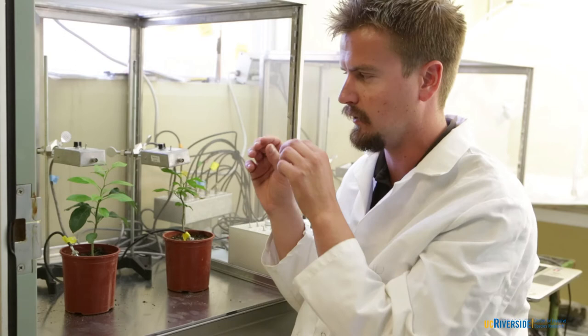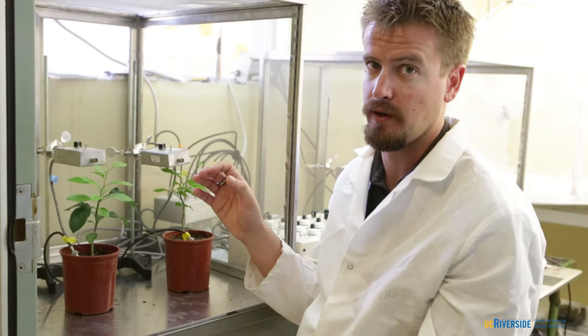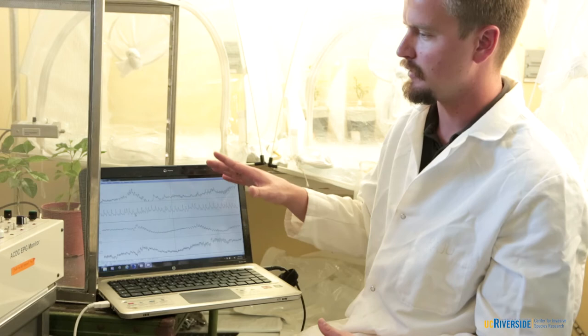That's exactly what I'm doing here, except that I'm using the little teeny tiny muscles and valves inside the insect's head while it's pumping and sucking away different parts of the plant tissue to give us a waveform or pattern on the screen that we can then interpret where they are in the plant and how long they've been feeding.